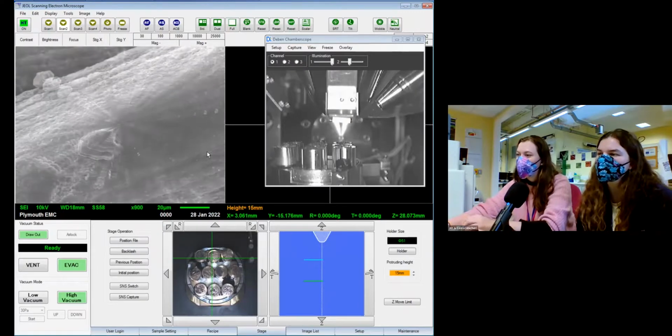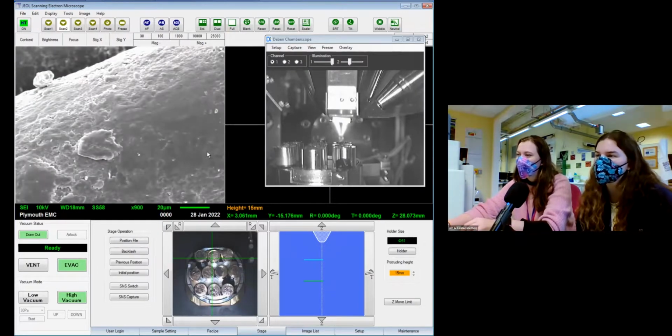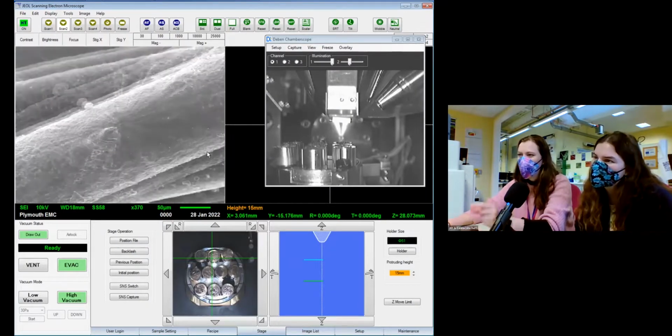Already you can see how that's quite different to the sheep wool. Looks a lot coarser than the sheep wool. Yeah, like really smooth, like not as flaky.